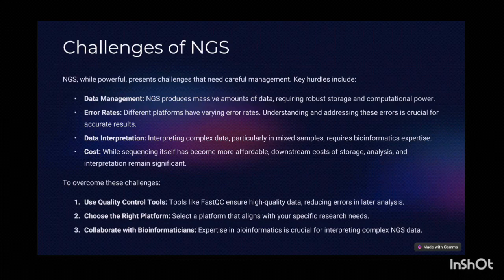Another is data interpretation. Even after sequencing and the initial analysis, making sense of the data can be very complex, particularly in metagenomics or other studies involving a mixed sample. So interpreting the results requires expertise in bioinformatics to accurately tell which sequence comes from which organism.